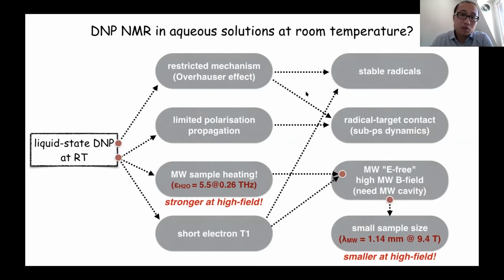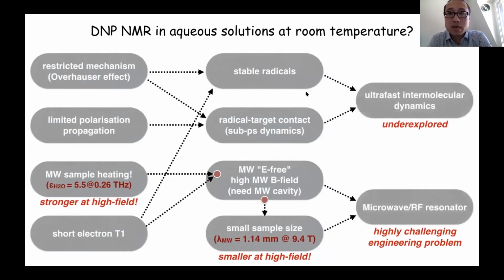However, at room temperature, we have to face many additional issues from microwave sample heating, microwave efficiency problem, which is related also to the small sample size. All these point to a highly challenging engineering problem, that is the microwave RF resonator.